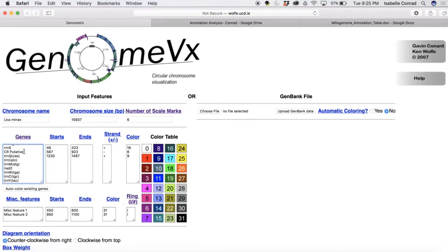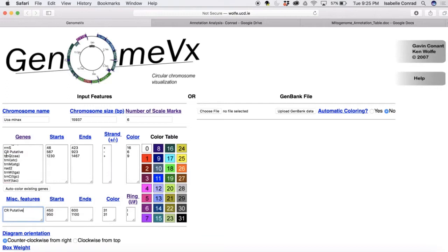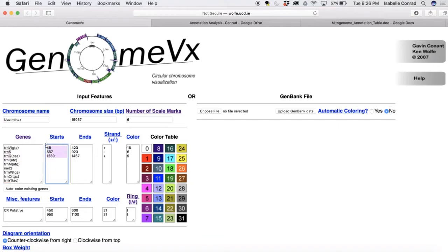We're going to delete that empty space at the bottom and then also delete the CR putative line. That is control region or the D loop. That's going to go under miscellaneous features. So make sure you delete that from the genes column.